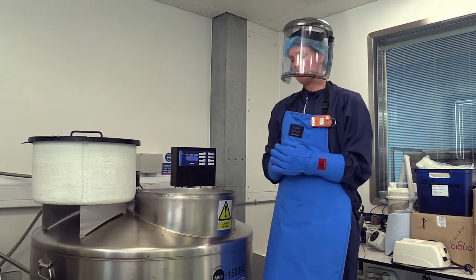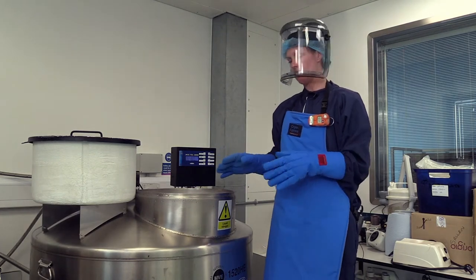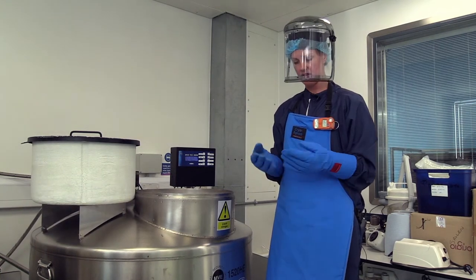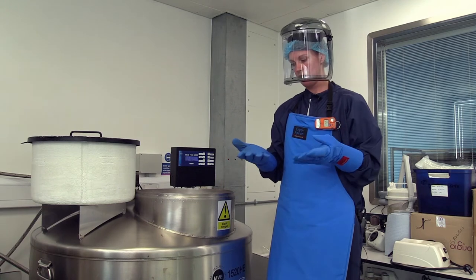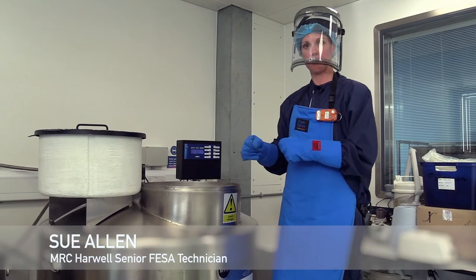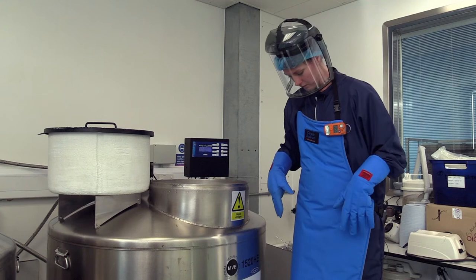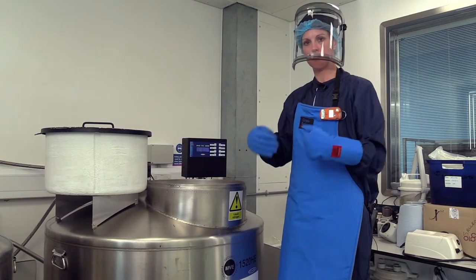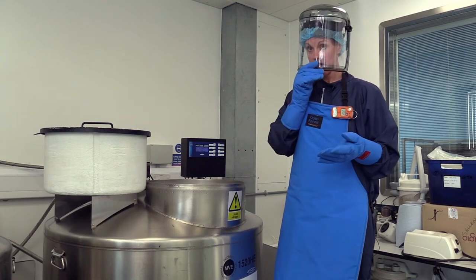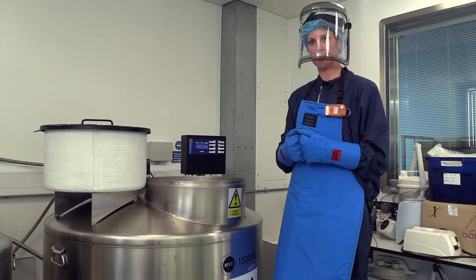Liquid nitrogen in the wrong hands can be quite dangerous. It's minus 196 degrees centigrade, so I need to wear these gloves — if I'm handling metal racks I might stick to them and it could cause burns. I'm also wearing an apron to prevent any spills burning my skin, and a visor to protect my face and eyes from splashes of liquid nitrogen.